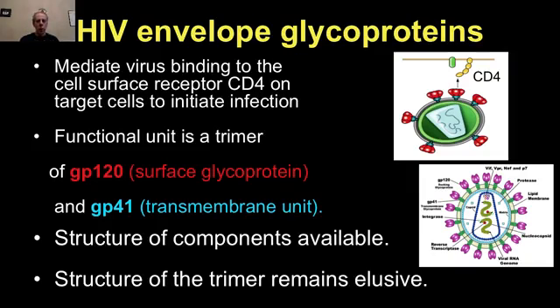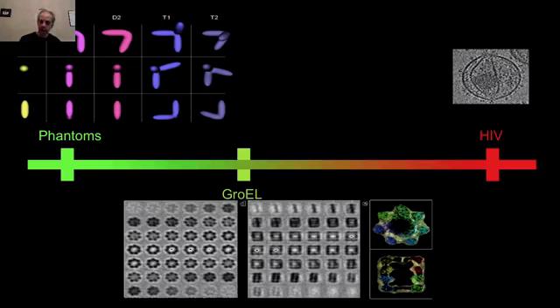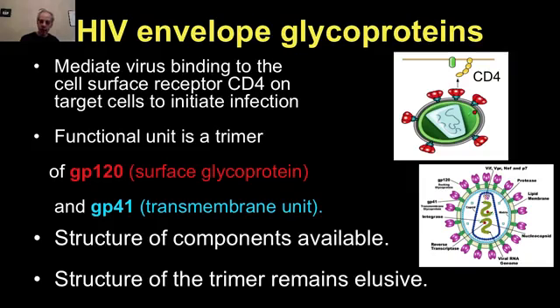Now, let me reiterate to you why this is so important in this schematic. These are what we have been seeing. Let me show that again. This is basically a true example from this cryotomography, one slice. And now this is a schematic of that. Now, as I say, when it goes and tries to latch itself into the membrane, it actually tries to basically grab onto something which is called a CD4 here. And then the virus has these two components that are the GP120, basically this red, and the GP41, this blue.